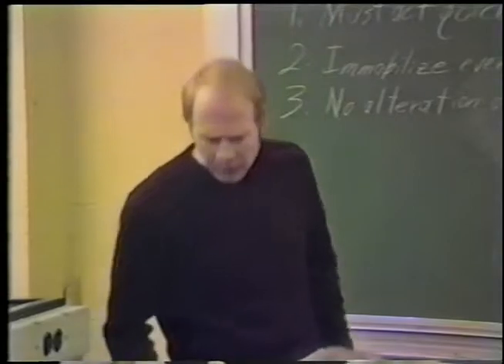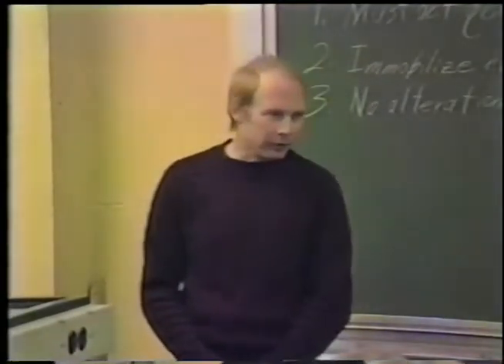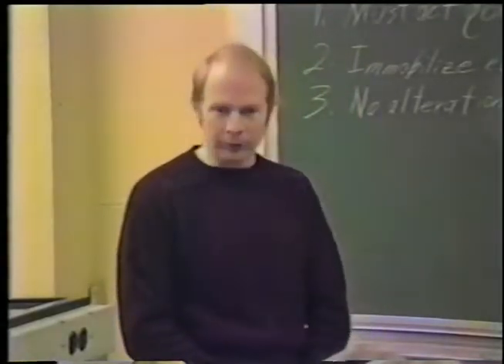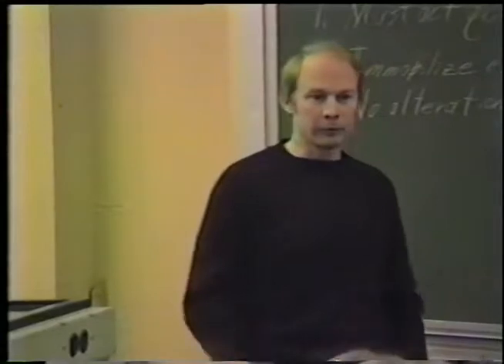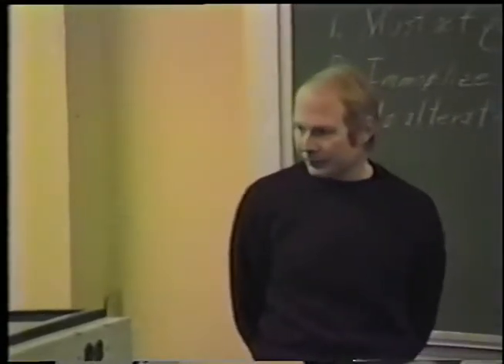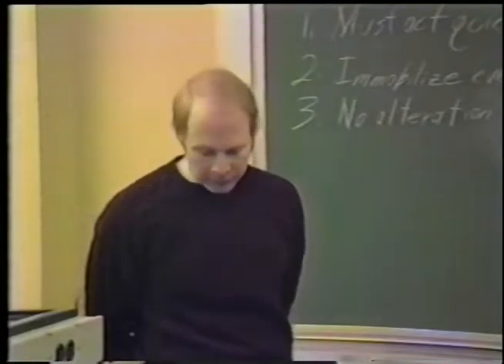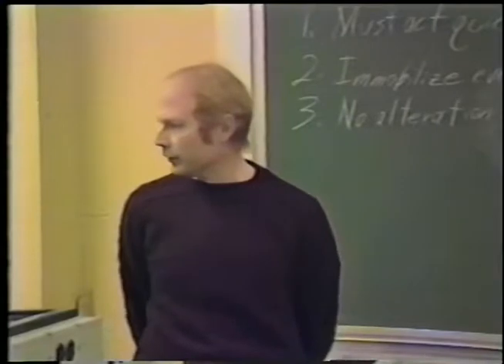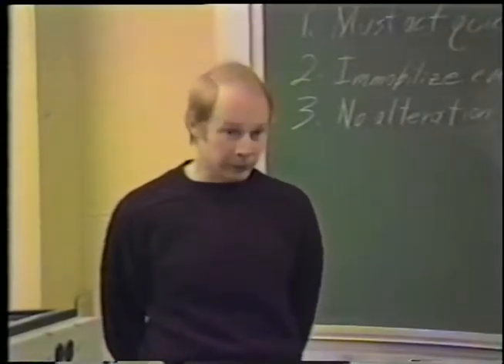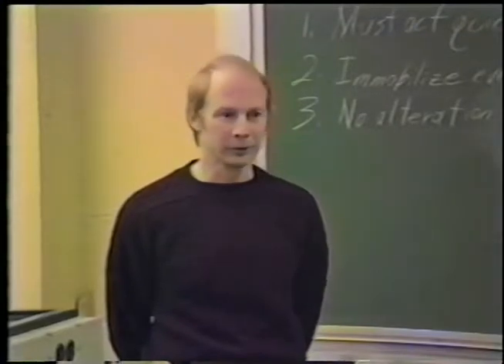Okay? In the face of all these problems with chemical fixatives, it's amazing that they preserve structure as well as they do. And virtually everything we know comes from our observations of chemically fixed material. So they can't be damned completely. But it's becoming very clear that if we're going to refine our knowledge of cellular ultrastructure beyond where we are now, more investigators are going to have to switch to ultrarapid freezing techniques.